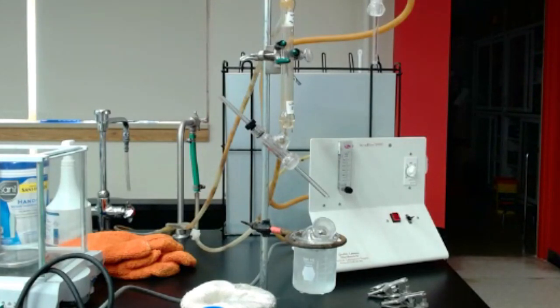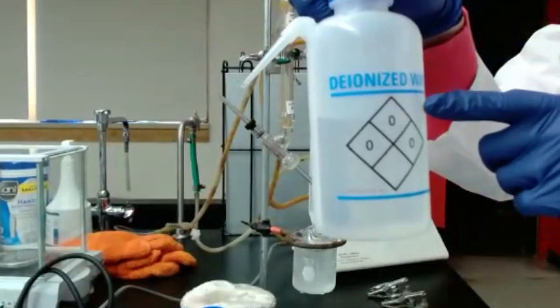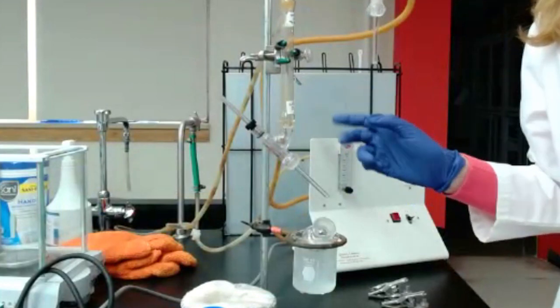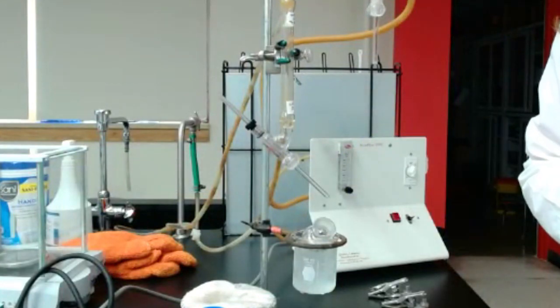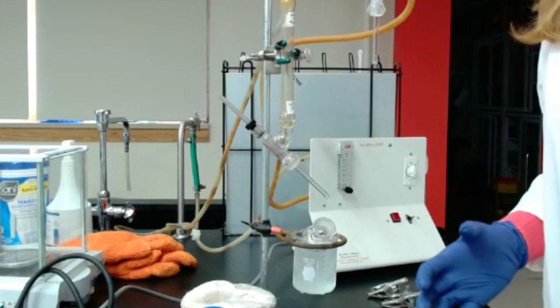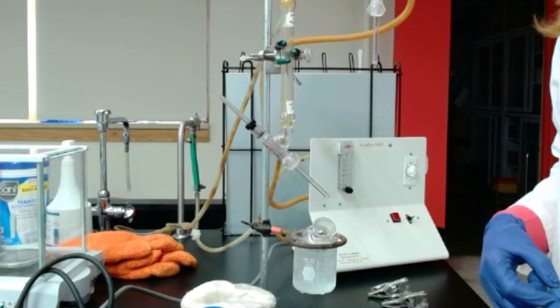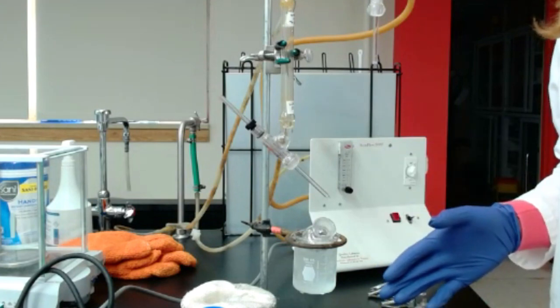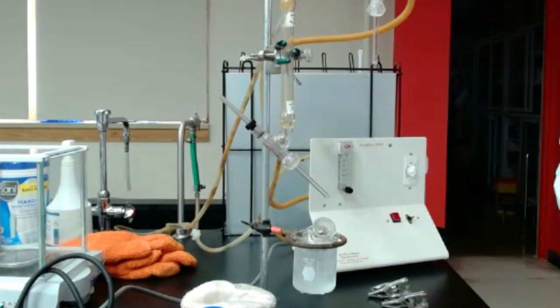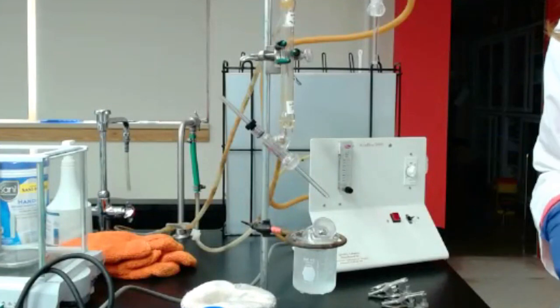You will need some water. So we always use those fancy pipettes. That's DI water, just to rinse all the equipment, all those systems, to avoid having any crystals, anything that will build up. Also, we use a burette. Also, you will need a data recording document. So today you're going to have to record the initial volume of sodium hydroxide you have in your burette, as well as the final volume of sodium hydroxide in your burette. And you will be able to make the calculation for free and total volume, so total volume used. And then you will use that data to calculate how much free and total SO2 you're going to have.